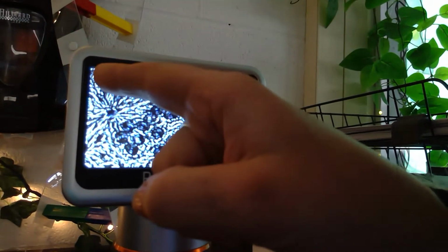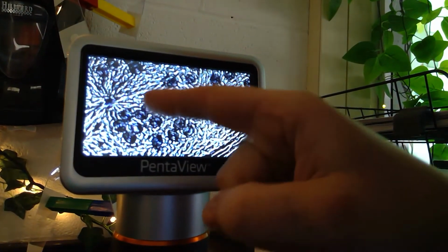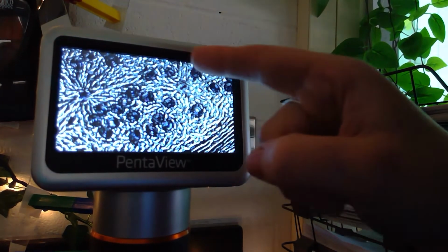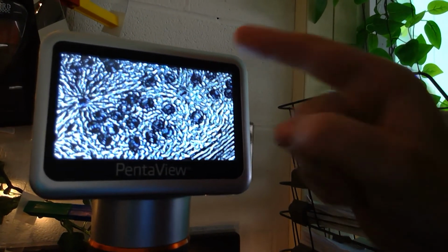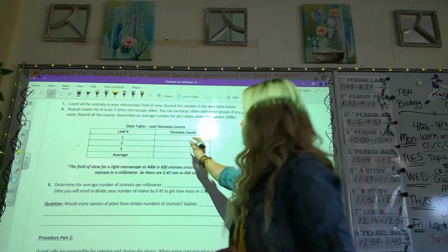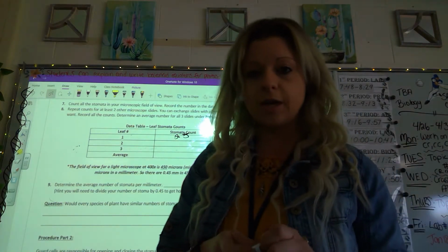So 1, 2, 3, 4, 5, 6, 7, 8, 9, 10, 11, 12, 13, 14, 15, 16, 17, 18, 19, 20, 21, 22, 23, 24, 25. All right. So going back to my data table here, I'm going to have 25 stomata, okay?